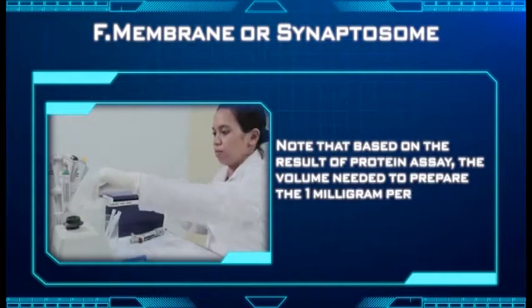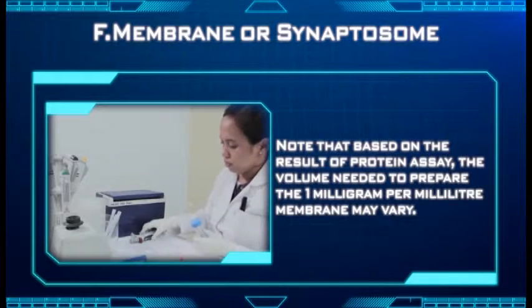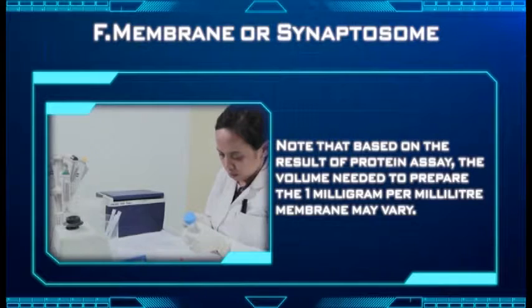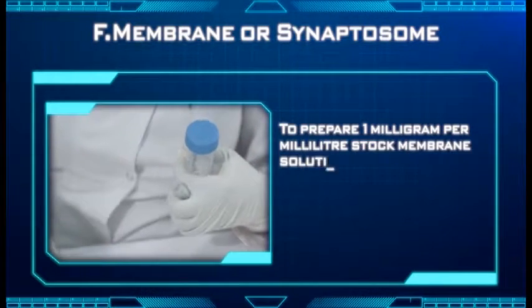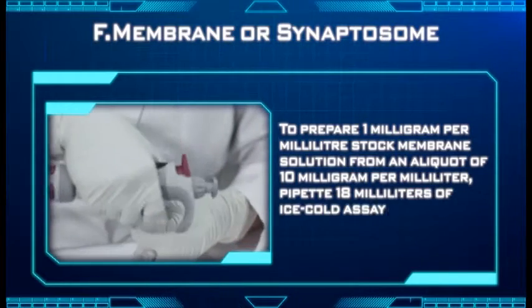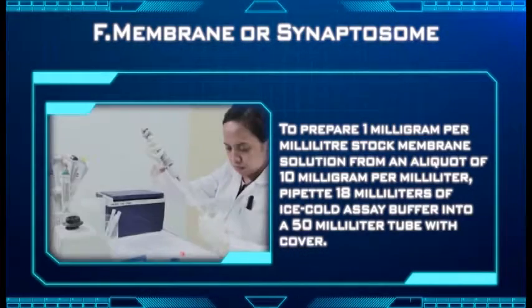Note that based on the result of the protein assay, the volume needed to prepare the 1 milligram per milliliter membrane may vary.